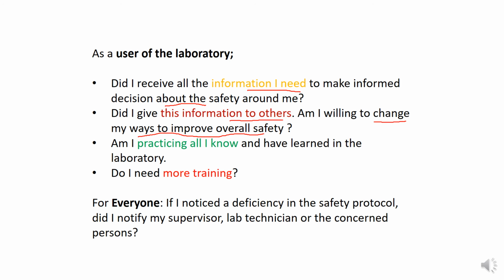So many people come and many people go, so you have to be willing to change according to the situation, overall safety. And also, you have to practice whatever you learn about the lab, and of course you do it practically. And if you think you still need more training, you can get training, I mean, like attending workshops or some others.